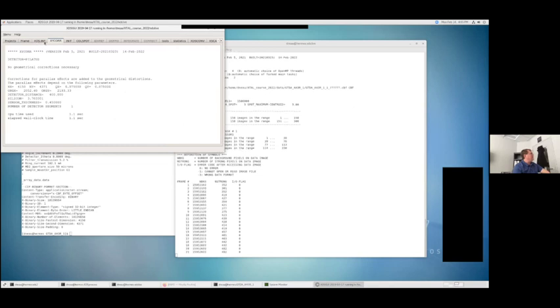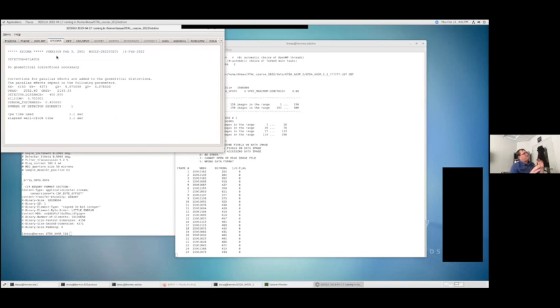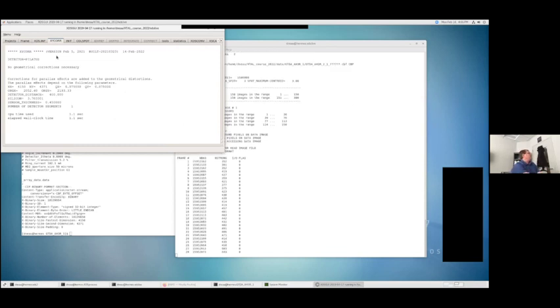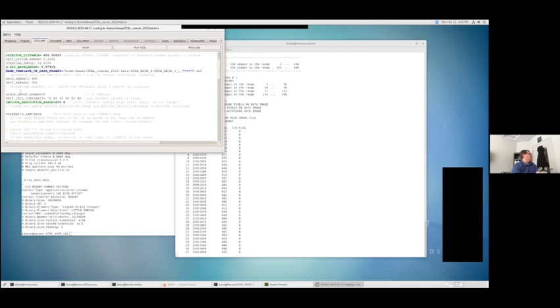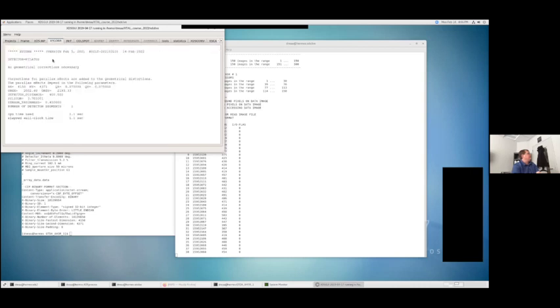XY correction is just a spatial correction that takes account of some of the geometrical distortions for the detector. It bases this off of a background range in the XDS.INP. If it's not given, there's a default value that it looks at.